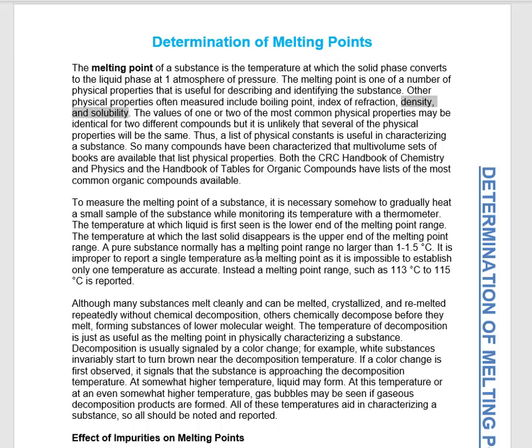And so to be as precise as possible when you are looking at your melting point ranges for these known compounds, you do want to gradually heat the sample. All right, so that means you don't want to just ramp it up really fast. You want to take your time. And so one of the things to make sure of here is your melting point range for a very pure substance usually has a melting point range that's about 1 to 1.5 degrees Celsius within the literature value.